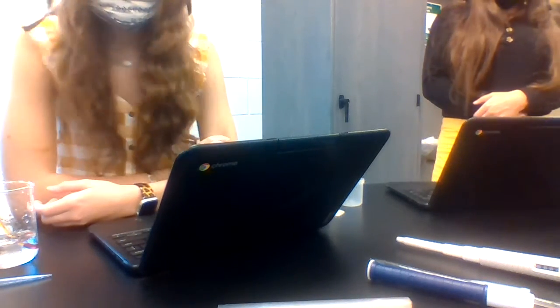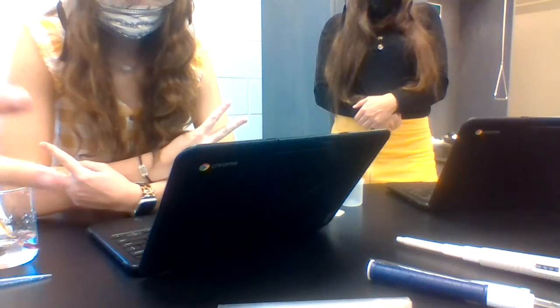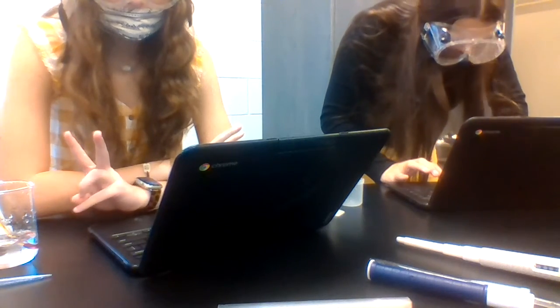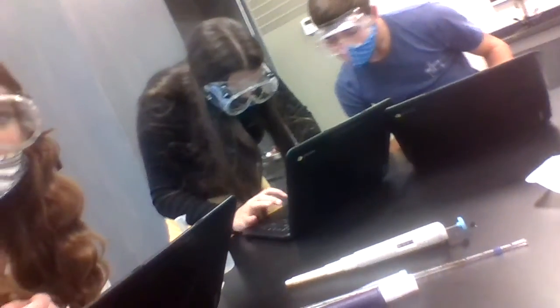This is just 1 milliliter, right? And this is just 2 milliliters. Should we just put the camera to show them?